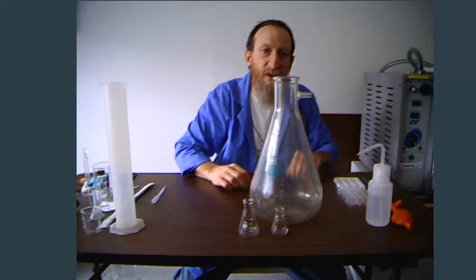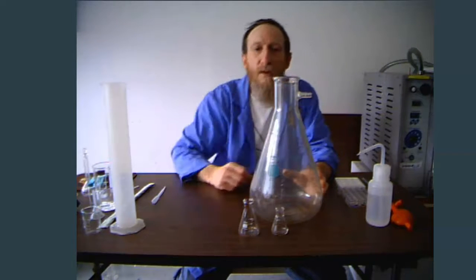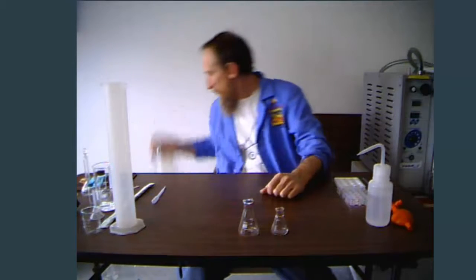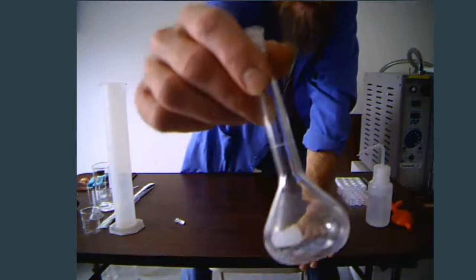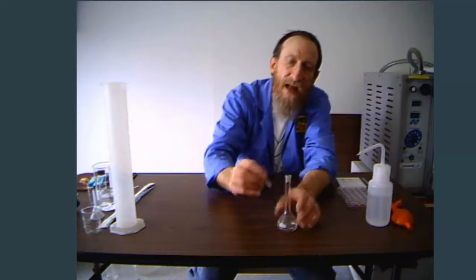There's a big funnel that sits on top with a vacuum plate, and you hook the vacuum hose onto the side. It will pull any liquid through, helping to dry your filtrate more quickly. Another type of flask is called the volumetric flask — a very, very precise instrument. This one reads 50 milliliters plus or minus 0.10 milliliter, TC, which means to contain at 20 degrees Celsius. When the bottom of the meniscus is right on that white line, that is exactly 50.0 milliliters. Some have snap tops; this one has a ground glass stopper.